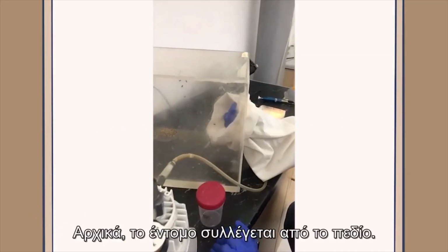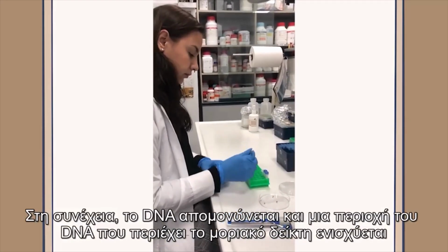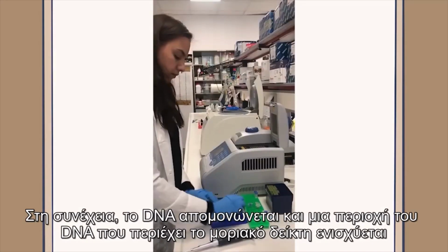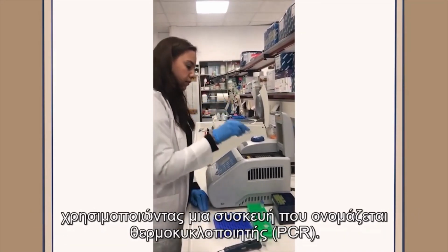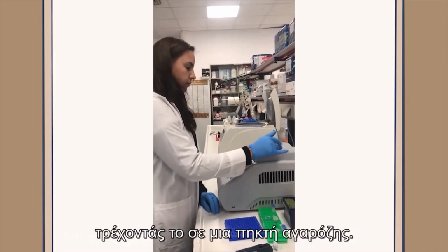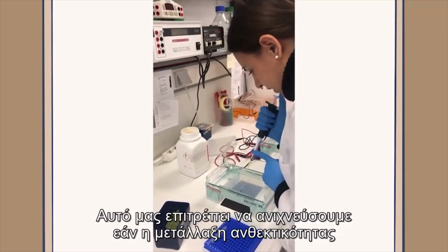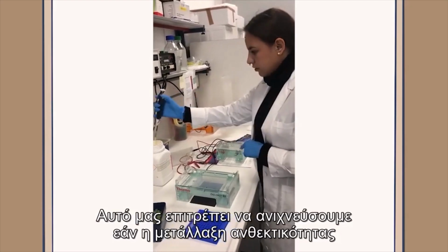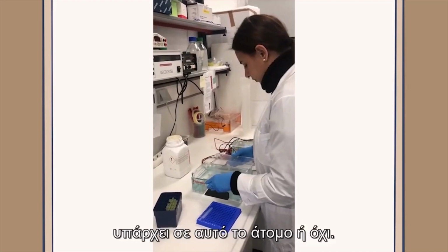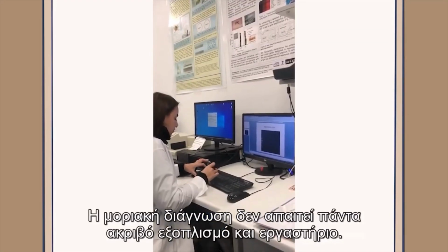First, the insect species is collected from the field. Then, DNA is extracted and a region of that DNA containing the marker is amplified using something called a thermocycler. Following that, the region of DNA is visualized by running it on something called an agarose gel. That allows you to detect if the resistance mutation or gene is present in that individual or not. Molecular diagnostics don't always require expensive equipment and a laboratory.